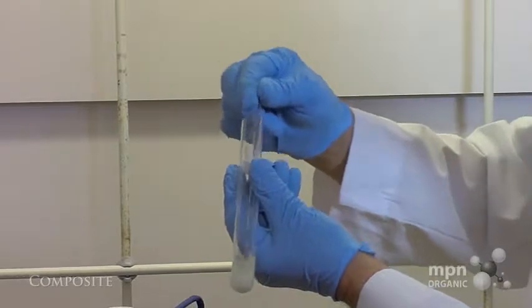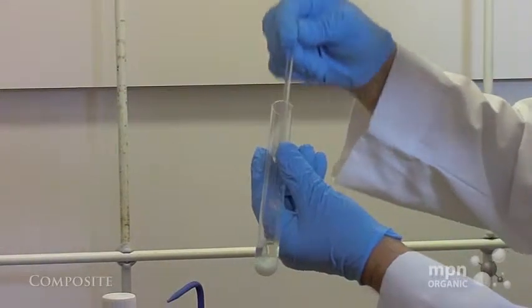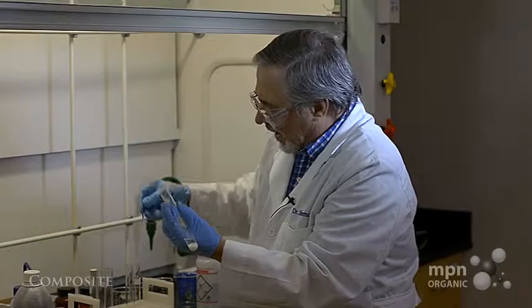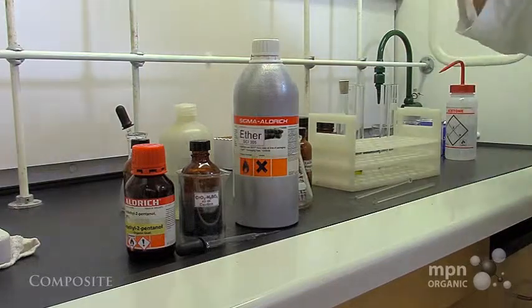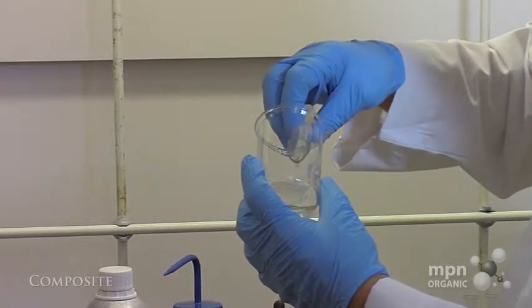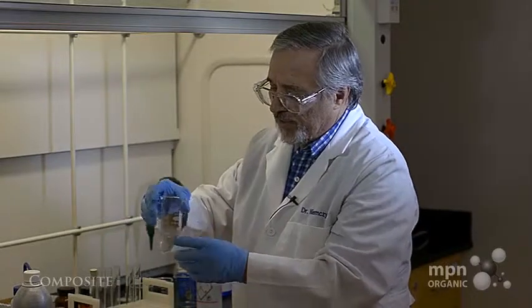So we're taking out the residual water with sodium sulfate. And the sodium sulfate clings to the test tube, and it's very heavy, so you can decant it out rather easily. I'm going to put it now into a beaker, and this beaker then is going to have this diethyl ether in it, and I'll be able to use the hood air supply to evaporate off the diethyl ether.